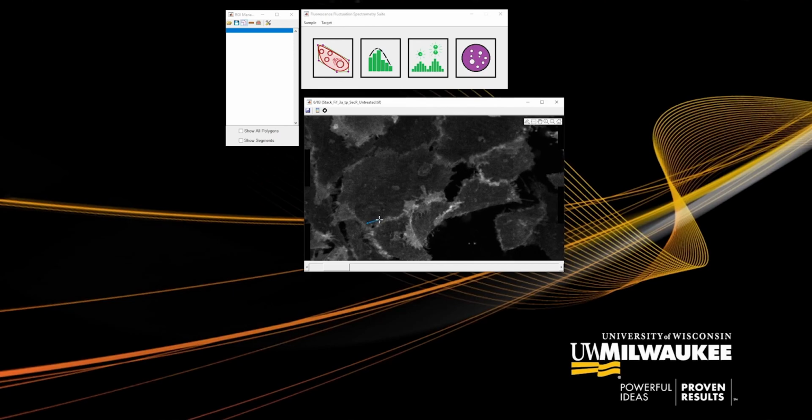With the cell membrane patches being analyzed here, we are interested in analyzing the smooth membrane patch in the middle of the cell. We are not interested in picking up the bright noise along the edge of the cell, so the ROI drawn here avoids the edge. To finish the polygon, simply click on your starting point and it will complete the ROI.